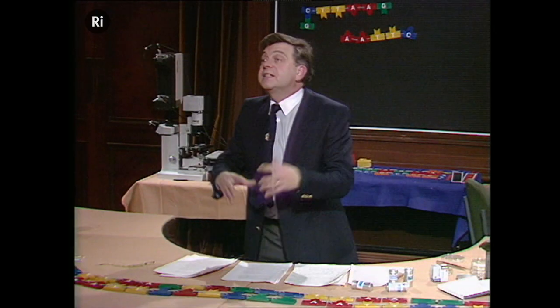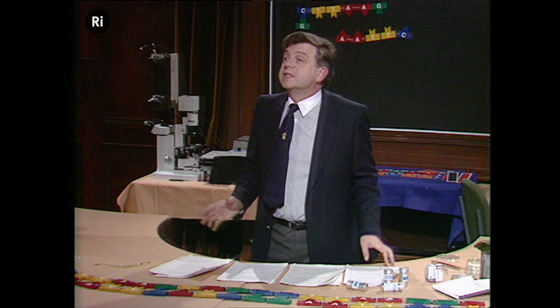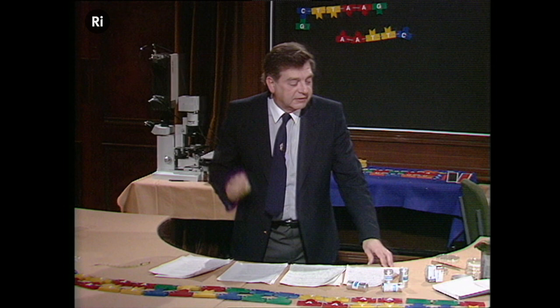How do we separate the different pieces of DNA that we've cut up and that we've joined? Now, to do that, we use a technique for separating molecules of different sizes that's widely used in biological work that depends on electricity. And we've got an example of it here.